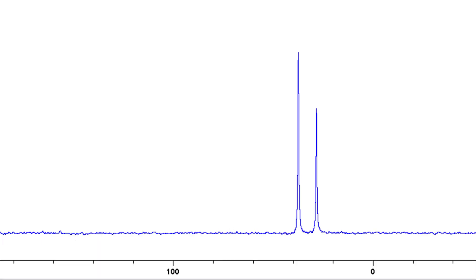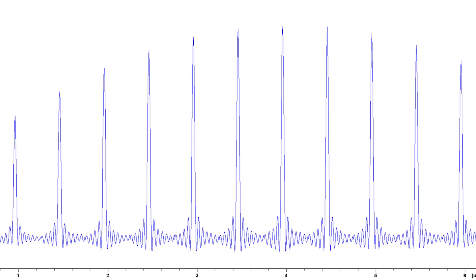Once that's done, we have to set up the cross-polarization CP MAS parameters. In this case in Bruker, we're talking about the exonucleus pulse, in this case carbon. It's the proton power PLW2 and the decoupler power PLW12. But being careful not to put the decoupling power too high so that there's no arcing. For each of these parameters, we can use the parameter optimization command, POPT, that gives you several attempts, showing the peak height and signal strength for each attempt and determining which one is the best.